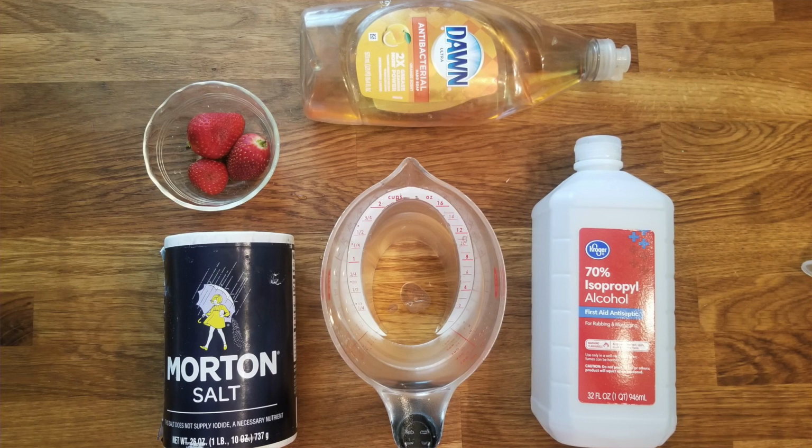Now that we know a little bit more about DNA, we can begin to extract it from our strawberries. Strawberries are particularly good for this lab because they're soft and easier to squish and pulverize, and they yield a lot more DNA than other fruits due to some genetic traits of the strawberry. Now we're going to start extracting our strawberry DNA.